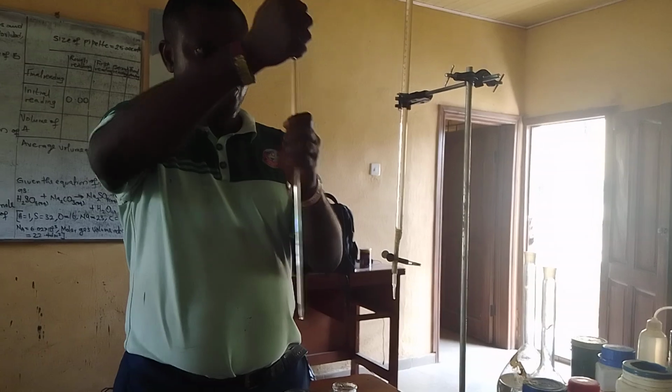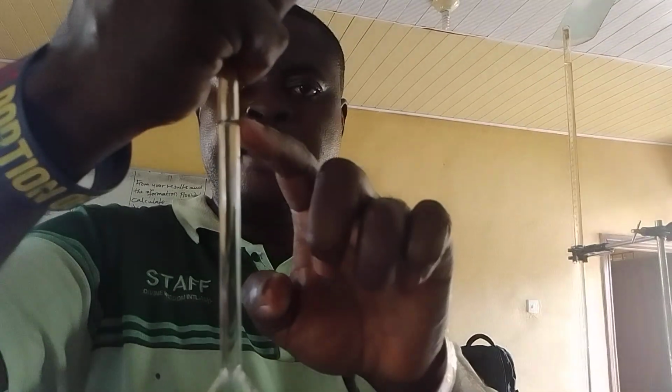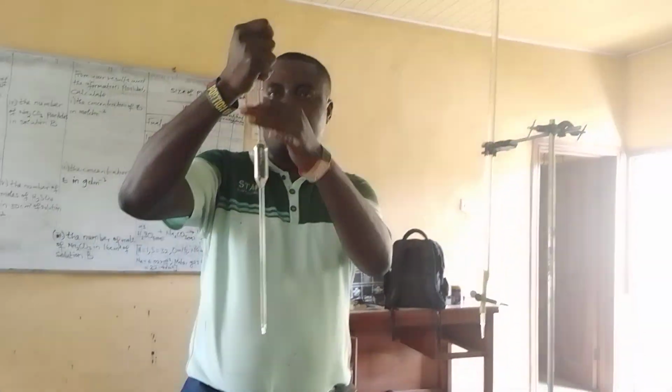Okay, so you can see now that the liquid is at this level. So that is what I have. What that means is that the amount of B inside here now is 25 cm³.